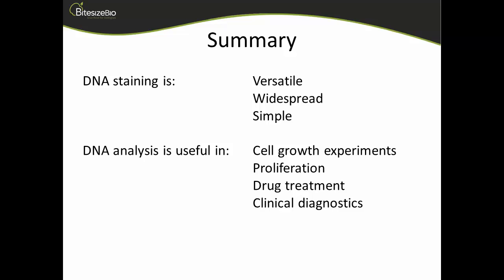Okay, so we would check a couple of things. We would check the quality of the DNA histogram, so at what point is our CV optimal. But we would also check the viability, because we want to make sure that we're getting a good CV, but we're keeping the cells alive, that we're not killing them. But even then, that may not be enough, because we may come to a point where we think that's a good concentration of dye, it's not toxic, but it's not toxic at that time point, is it? You want to try and leave those cells in culture for 24 hours. Do they proliferate? Do they maintain that viability?